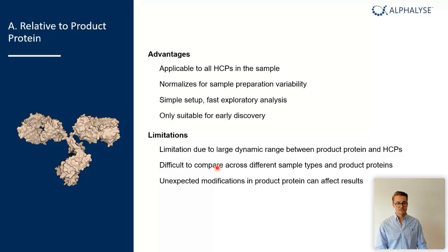Unexpected modifications in the product protein can affect results. So if the peptides you're using somehow get affected or have a modification, this will and can affect your results.